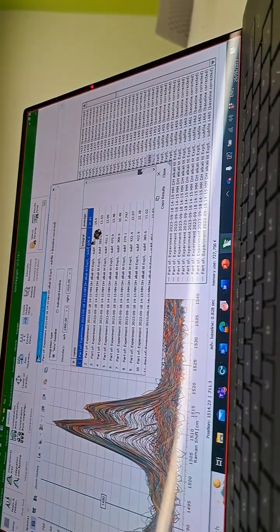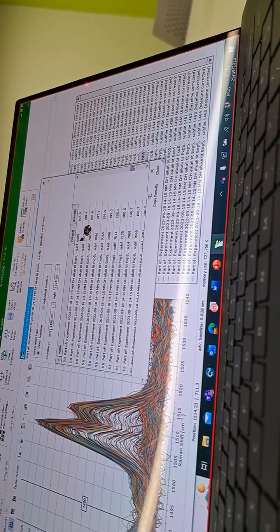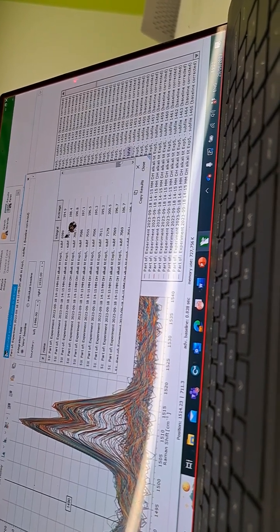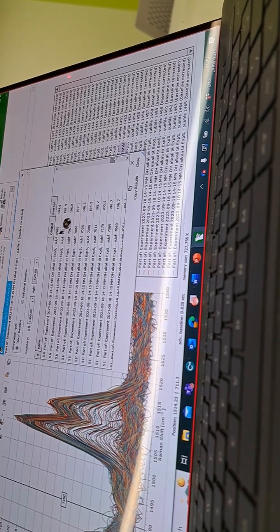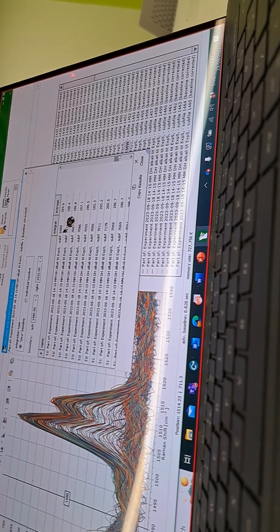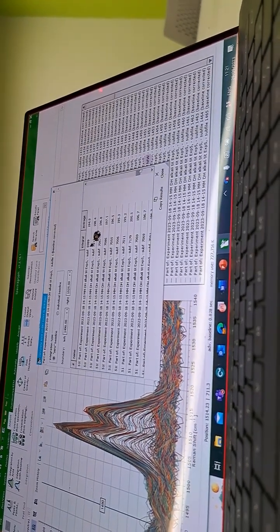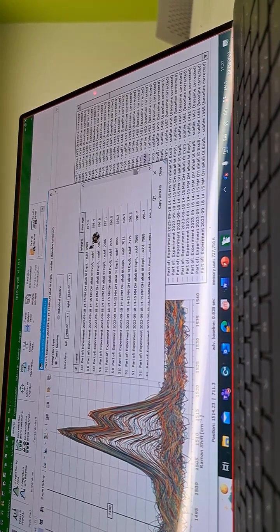But just a question, Martin, why are my values at the start not negative? Why do you think they should be negative? Because the integral of a peak is a calculation of an area. That would infer that you are expecting a negative area, or it should be zero, or maybe I'm saying it wrong. No, I know what you mean, but you should not be expecting a negative value.